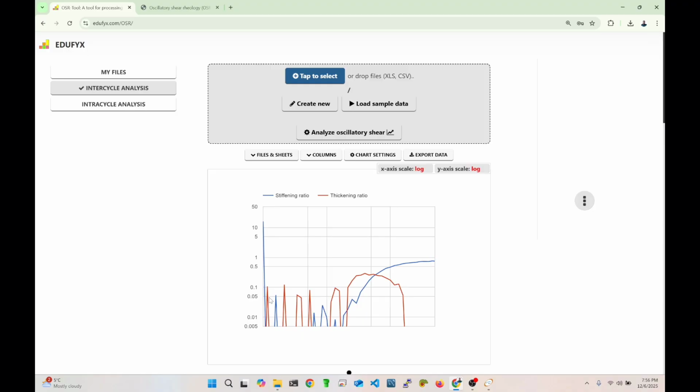This is an example of where perhaps stress filtering can help you, because these values are calculated. You can check the paper. Usually values that are calculated via differentiation may have some noisy data.